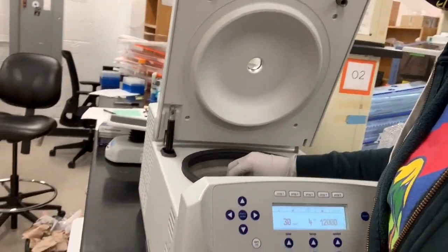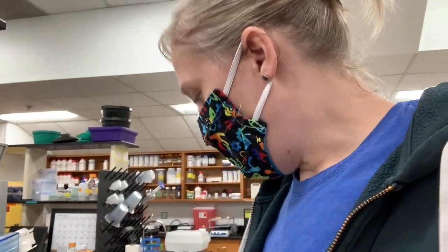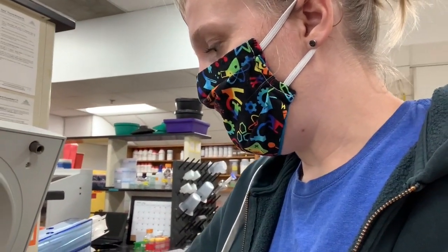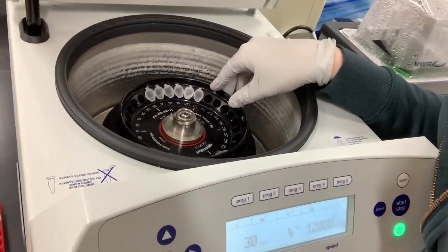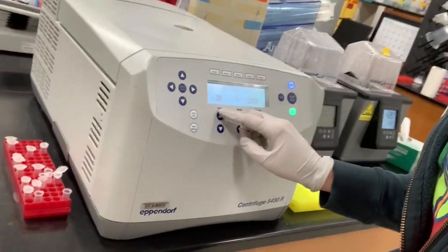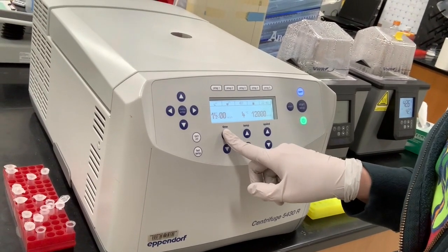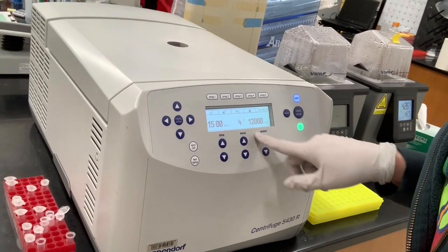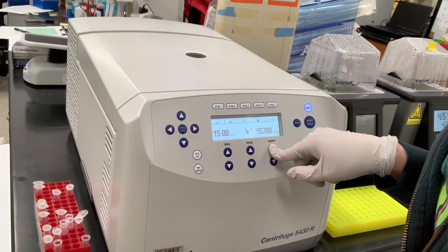Again, every time you use the centrifuge, you want to make sure that the samples are balanced, meaning that you have tubes on each side, and you can use just a tube that has water in it if you have an odd number of tubes if you need to. So I've put my samples just across from each other in the centrifuge. I'm going to now close the lid, make sure that it clicks. The first spin is for 15 minutes, so I'm going to increase this to 15 minutes. And this is still at 4 degrees, and I'm going to set this at maximum speed.